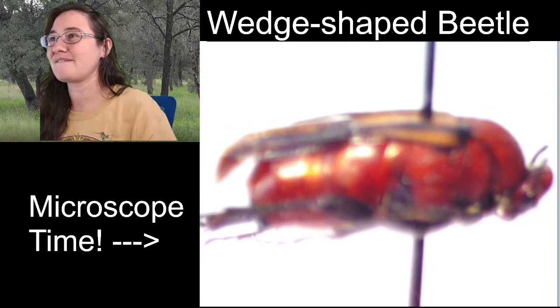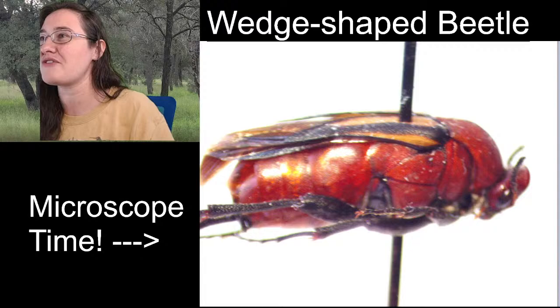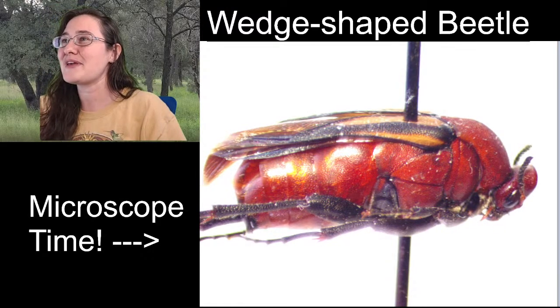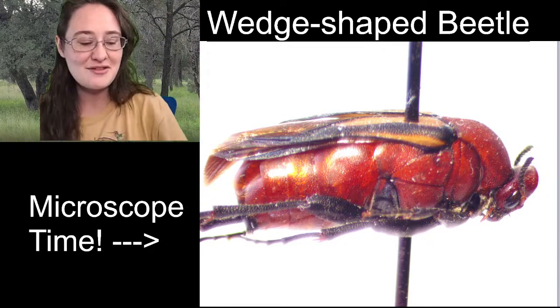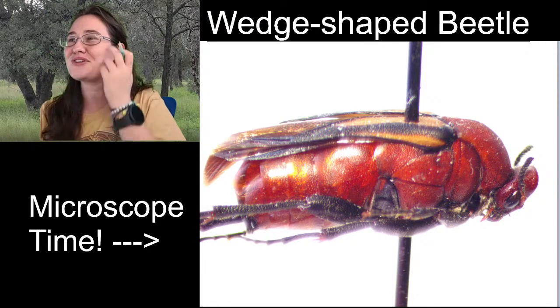Alrighty. So I'm thinking that this one will be a fun one to go ahead and sketch laterally because you have so much of this height here on the beetle, whereas if we tried to sketch it from the top, it would be so narrow.